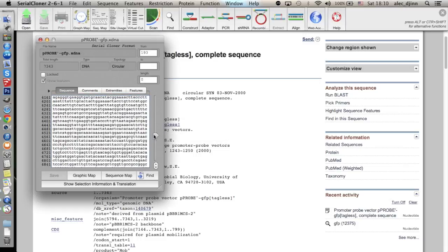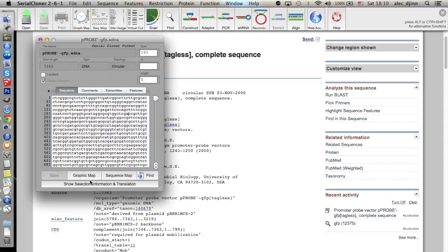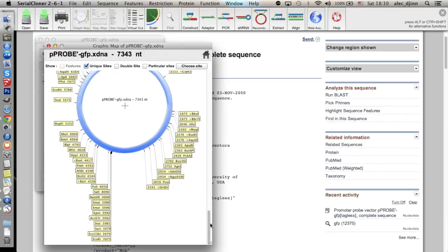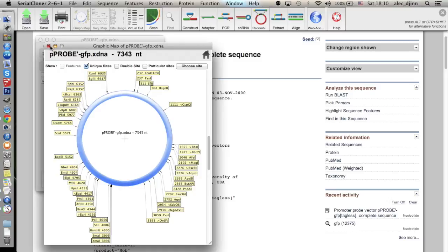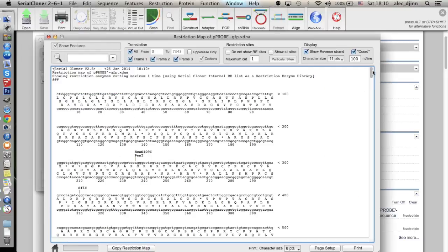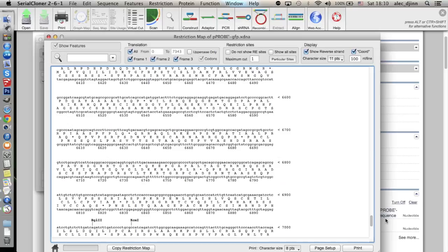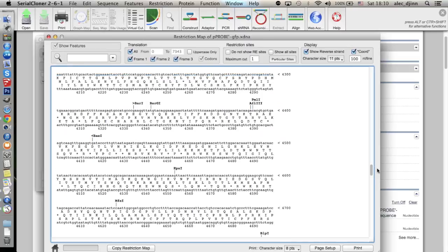At this point, we are ready to look into the sequence and get some insight into this vector. Serial Cloner offers two options: Graphic Map and Sequence Map. If we click on Graphic Map, we can see a circle that resembles our vector, with tags referring to unique restriction sites. Clicking on Sequence Map, a window pops up containing the complete sequence of the plasmid — both plus and minus strands are printed, as well as the translations in between, referring to the three possible reading frames. Up to now, this sequence map does not contain much useful information beyond restriction sites — the rest is just an endless list of A, T, C, and G.